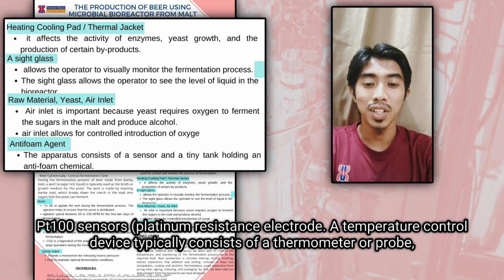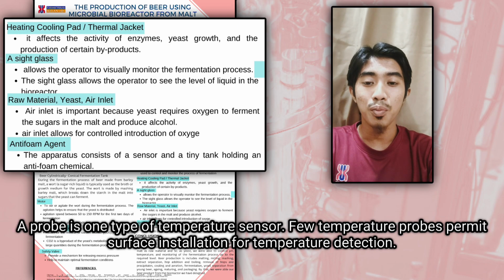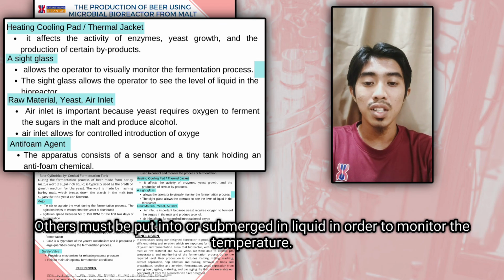PT100 sensors, platinum resistance electrode. A temperature control device typically consists of a thermometer or probe, a heating source, and cooling coils or a jacket encircling the fermenter. Using a temperature probe, the temperature of the culture broth in the fermenter is measured. A probe is one type of temperature sensor. Few temperature probes permit surface installation for temperature detection. Also, others must be put into or submerged in liquid in order to monitor the temperature.